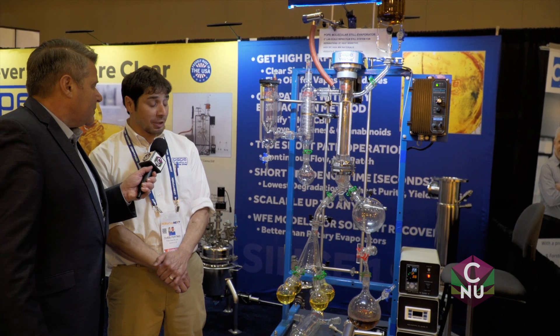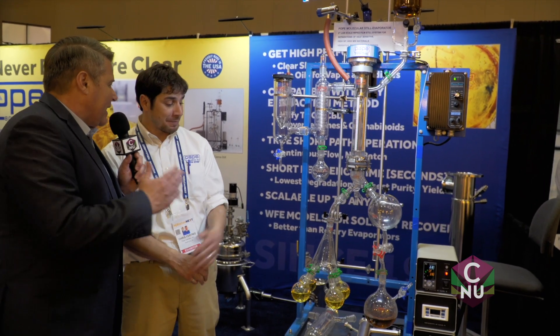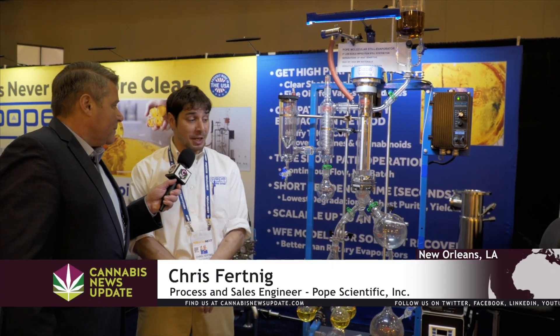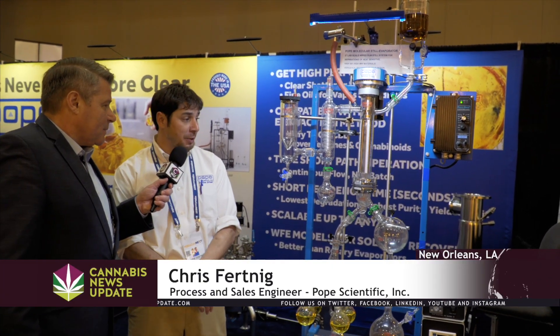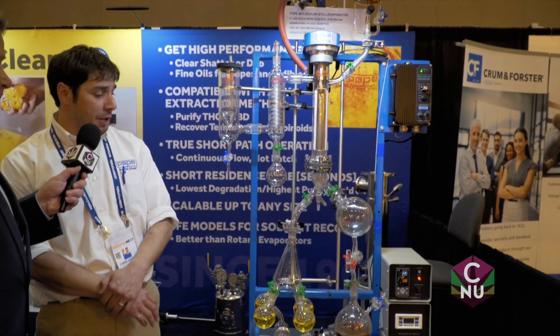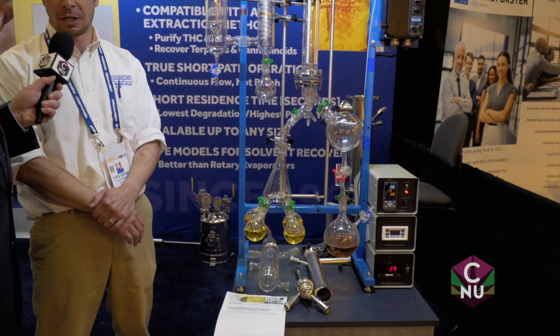This is post-extraction distillation, actually. You're with Pope Scientific, right? Yes, sir — chemical engineer at Pope Scientific. We've been doing distillation for decades, and we got lucky that cannabis is just another oil that we've been lucky to be able to distill.